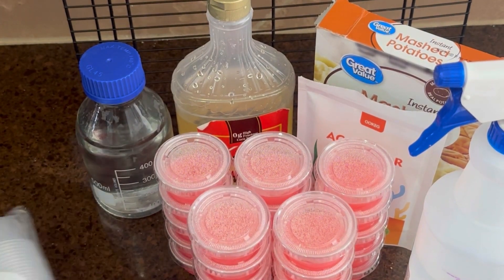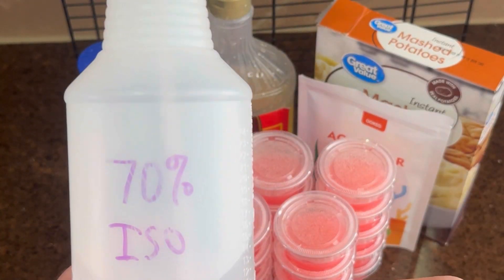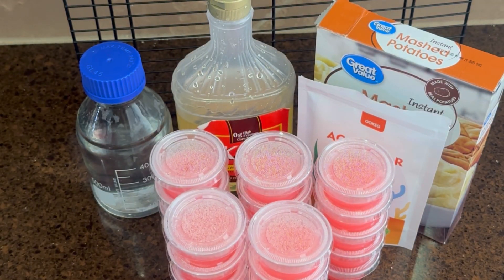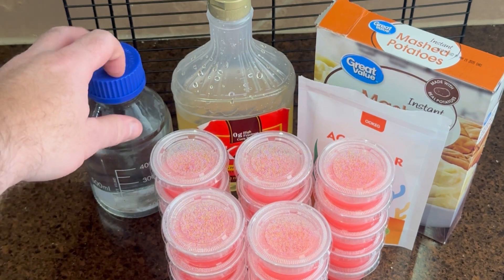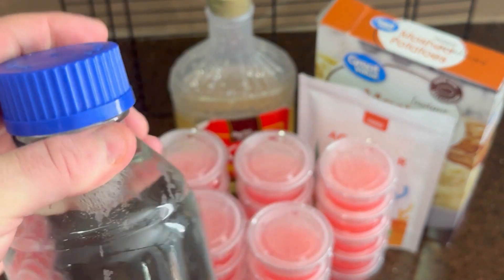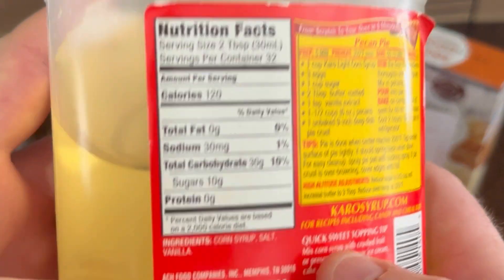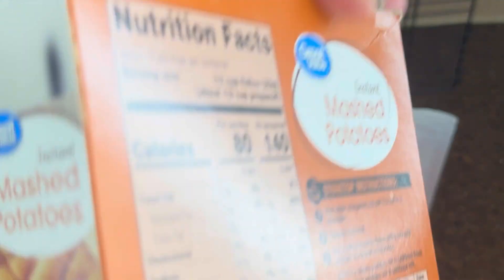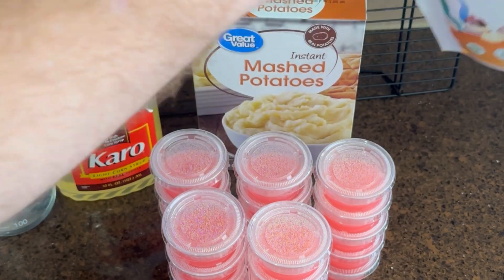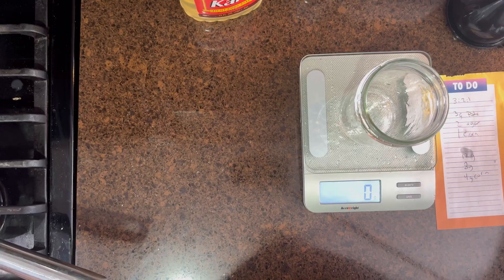Here's an intro of what I use: some ketchup cups, isopropyl alcohol to keep everything clean, a laser pointer — you don't have to have it but it's helpful. 400 milliliters of water, some light corn syrup — this one has vanilla in it which you're not supposed to use but it's what I have — some potato flakes to add carbohydrates for the mycelium to feed off, and then agar agar powder to give you that gelatin substance.